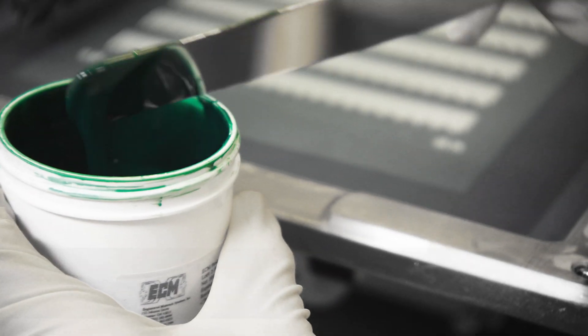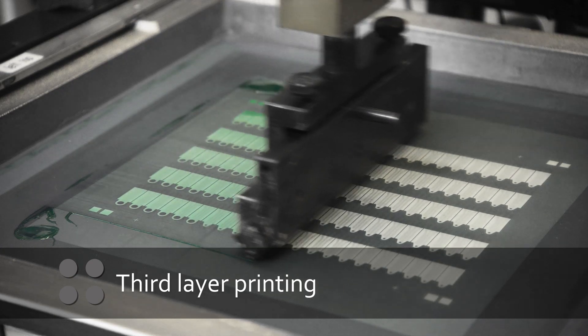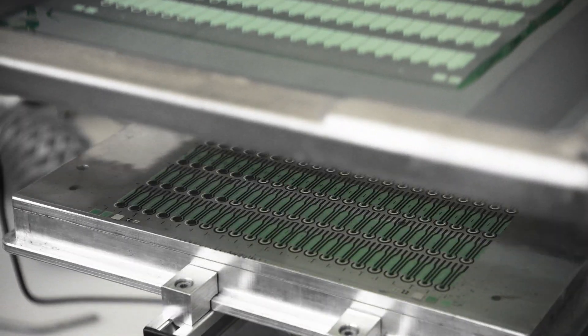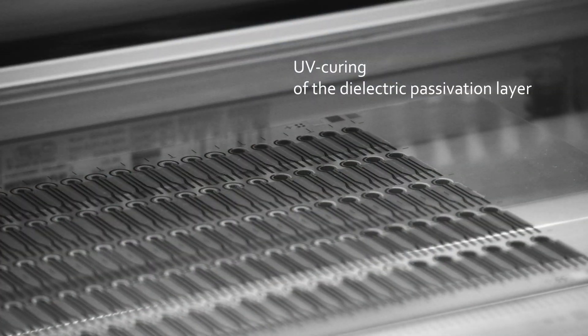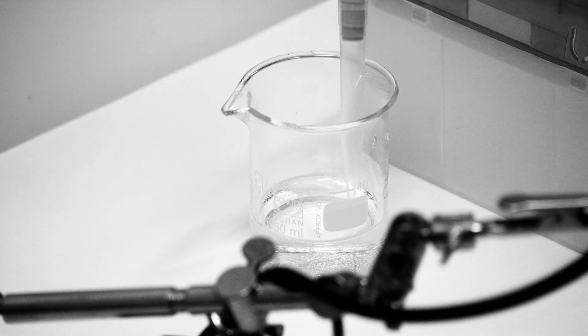We work with partners to provide sensors perfectly suited to the task at hand. After another thermal curing, third layer printing deposits a passivation layer made of UV curable polymer. The dielectric polymer defines the area of the working electrode and protects the sensor. UV light initiates polymerization. The electrodes are now ready for adaptable bio-functionalization.